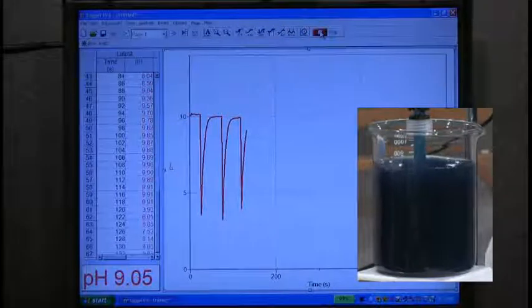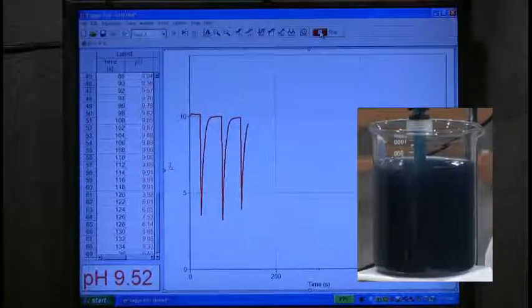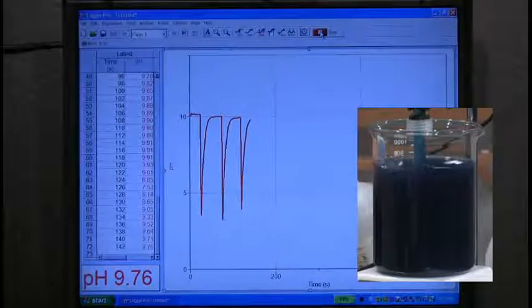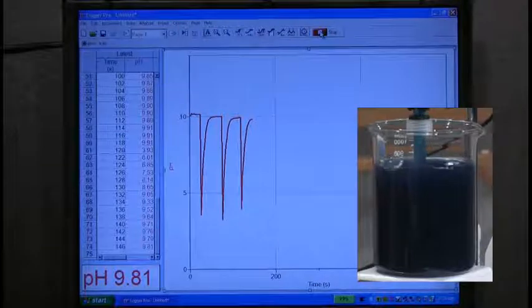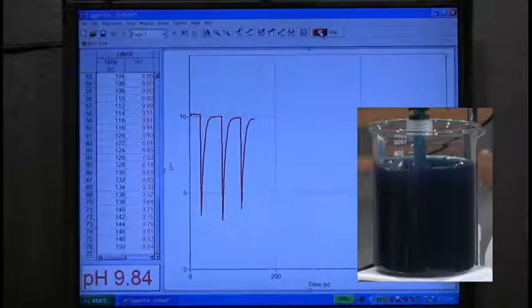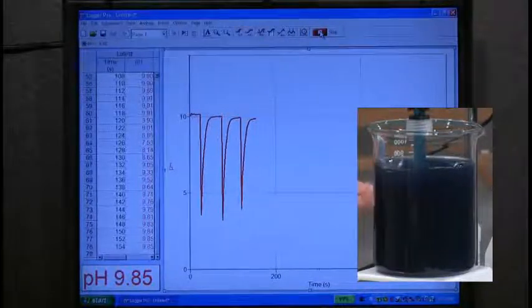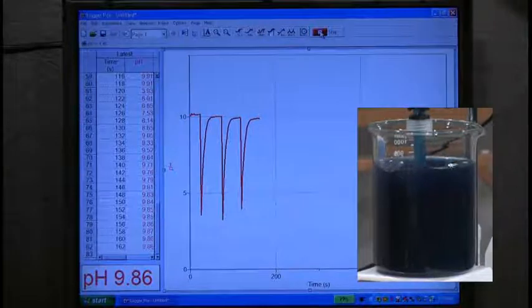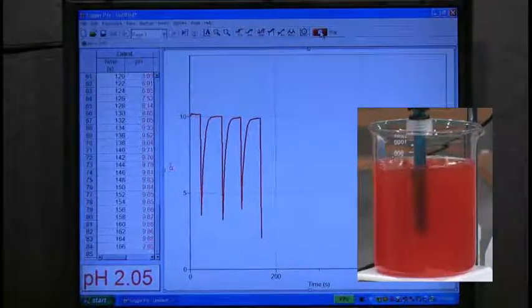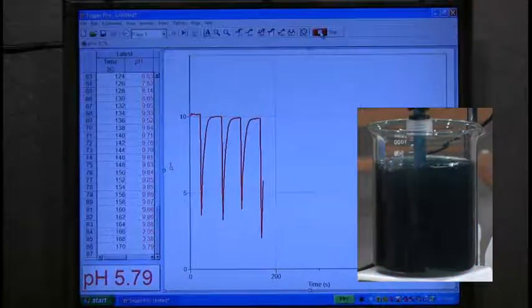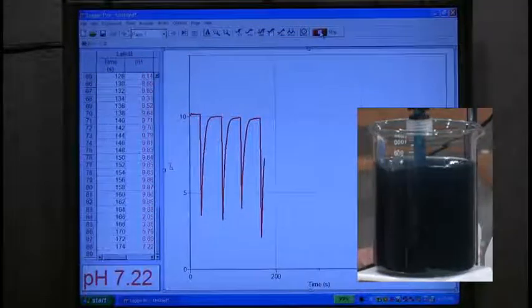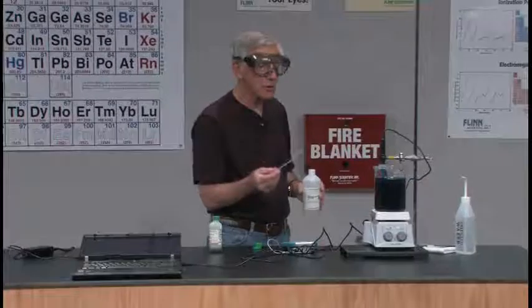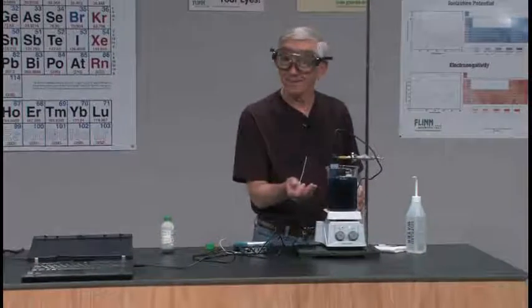Kind of important, as we're doing this, to let it get back to that level point each time. So, I'm watching here what you're seeing up there. Notice that it's taking longer and longer to get back to the purple. I'm going to reach a point, eventually, which all the magnesium hydroxide has been converted to magnesium chloride, paired up with the chloride ions that I'm injecting here. Here we go again. This has always been one of my favorite demonstrations, but adding this to it just really makes it nice.